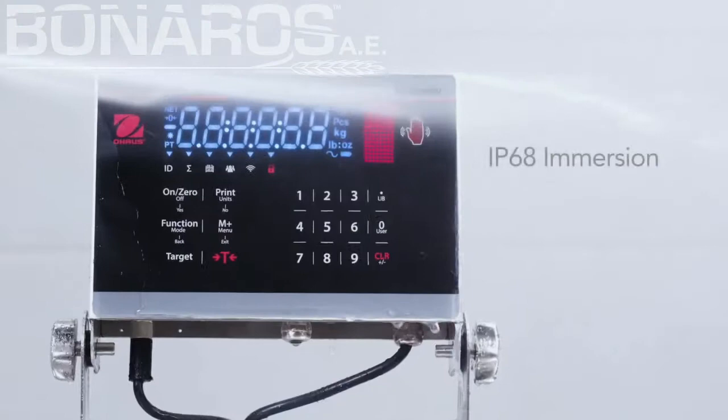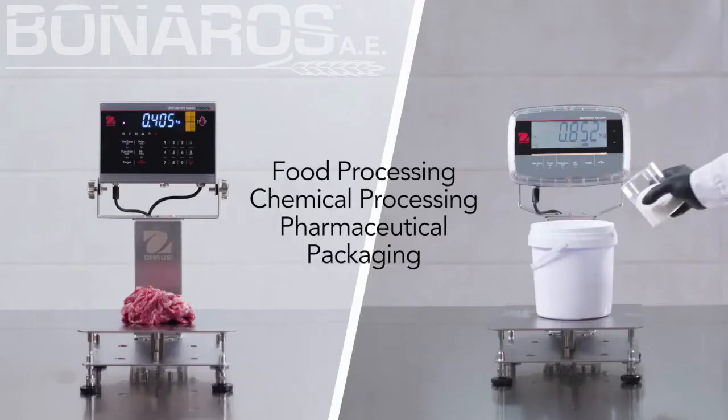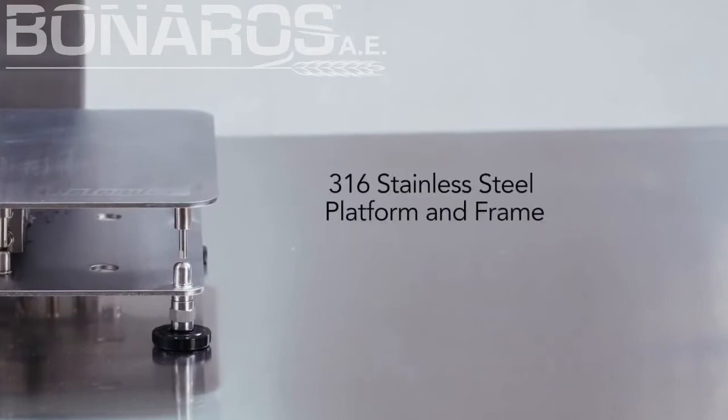Easy to clean and wash down, protected with advanced modes to meet demanding weighing needs. With an enhanced food-safe design and supreme durability, Defender 6000 is ideal for food processing and packaging environments.